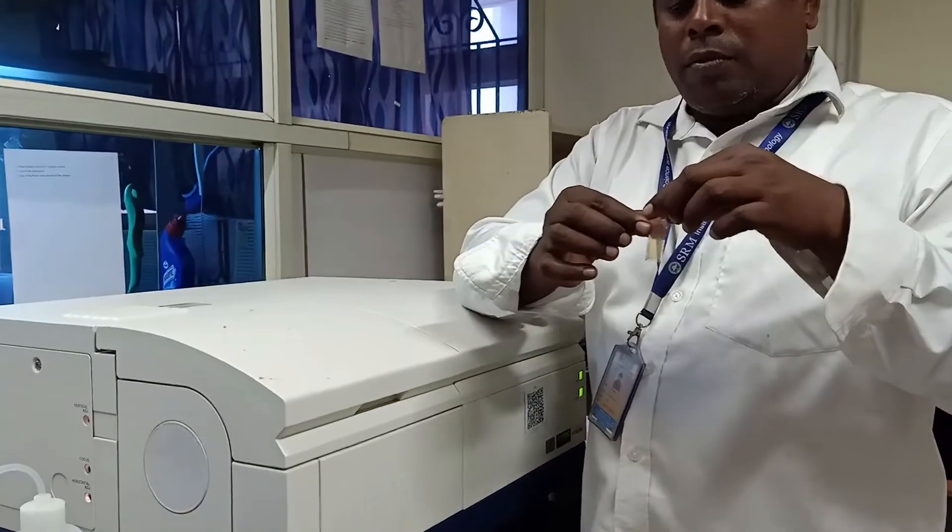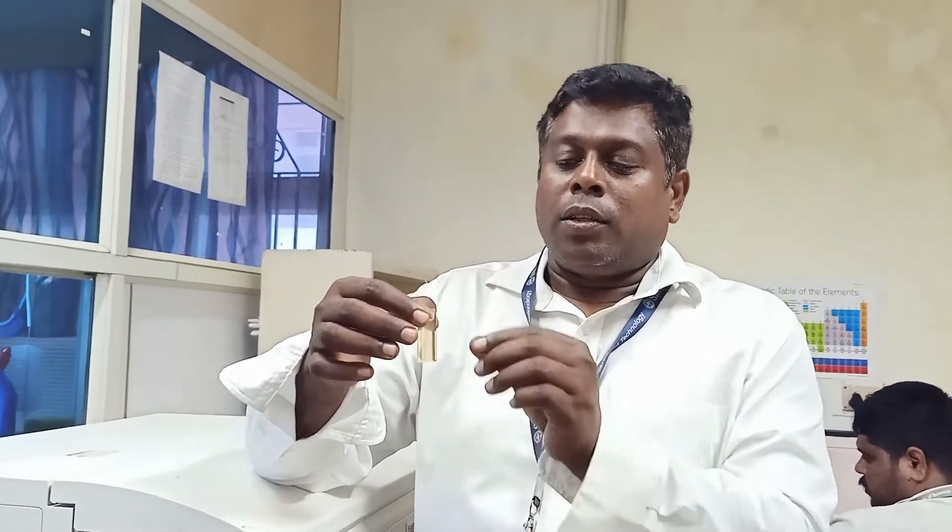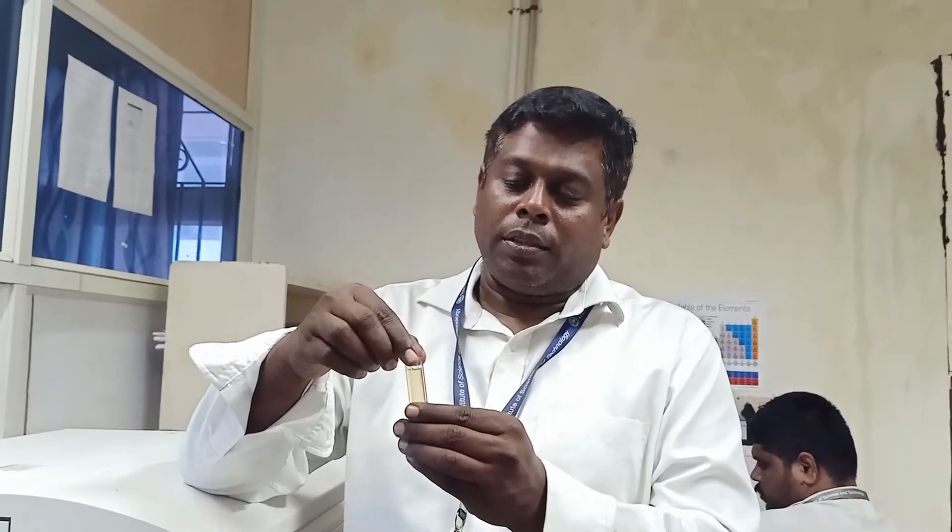This is what we call a cuvette. This cuvette is made up of quartz glass, and all four sides are transparent. In UV spectrometer cuvettes, they are only transparent on two sides, and the other two sides are opaque. Since our optical arrangement is at 90 degrees to each other, we need all four sides of the cuvette to be transparent.